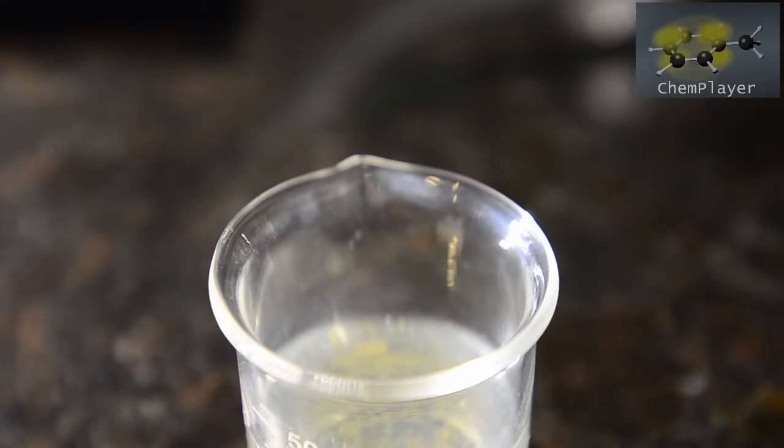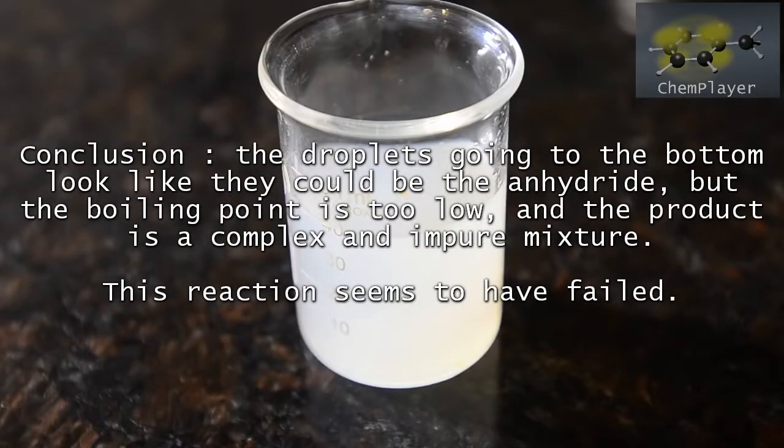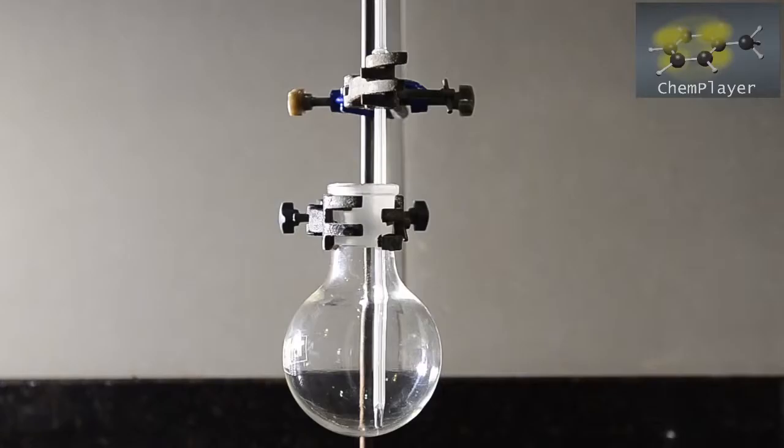Well, this sure isn't propionic anhydride, so we're declaring this a failure. After a while all the droplets of the liquid dissolve in the water, forming a milky mixture. Time for preparation method number 2. This is the classical method, similar to the one we used in a previous video for acetic anhydride.